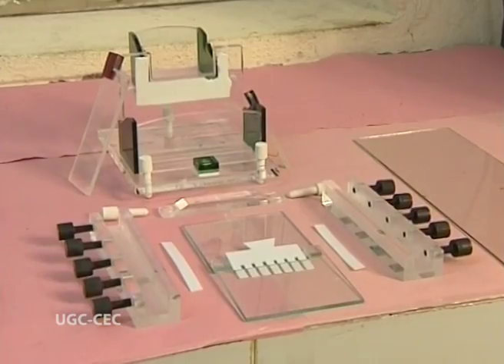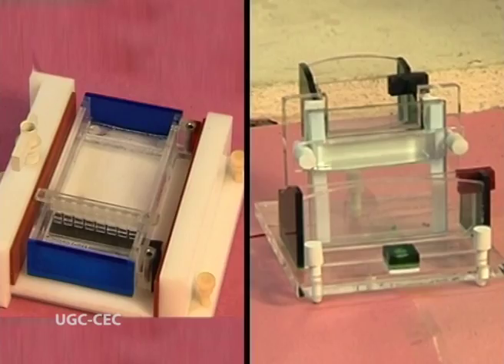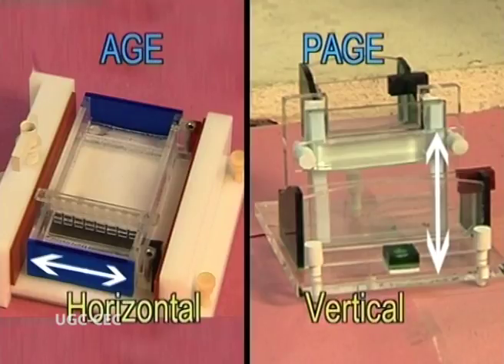The most recent and advanced technique other than agarose gel electrophoresis is polyacrylamide gel electrophoresis, abbreviated as PAGE. It also consists of two units, that is power pack and electrophoresis tank. The only difference between AGE and PAGE is that AGE is a horizontal tank whereas PAGE is a vertical tank. AGE is used for separation and quantification of DNA, whereas PAGE, that is polyacrylamide, is used for separation of proteins.